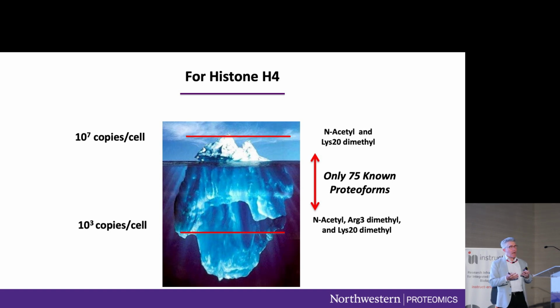It doesn't combine all of that. But the dominant canonical set of human proteoforms, at least in cancer cells, many different cell lines, some primary samples, is a shockingly low number, right? That's the worldview I mentioned earlier, that people are used to looking at histone H4 with all these modifications, and what are we proud about? We're proud about propionylation and isobutyrylation, things that are of quite low abundance. And yes, if you go deeper in the proteomic iceberg, you can get down to about 180 or so proteoforms.